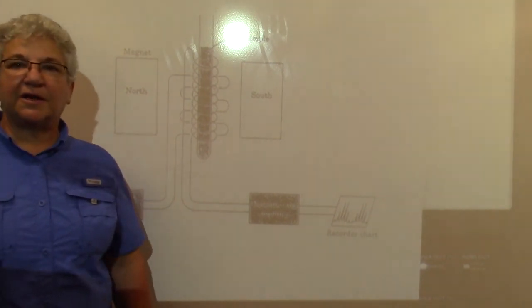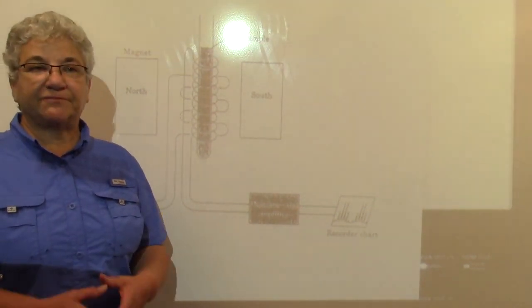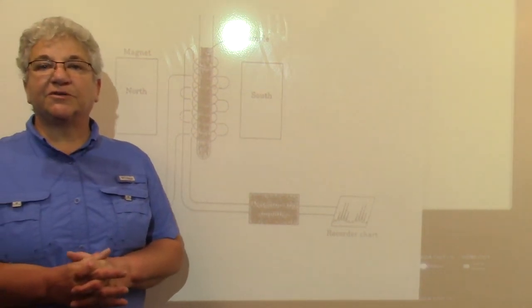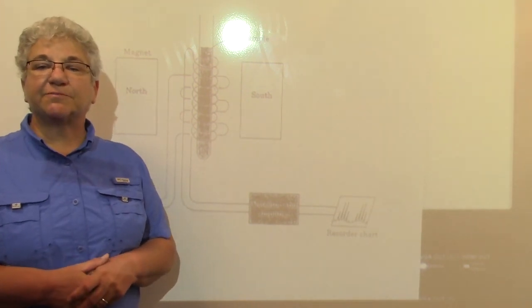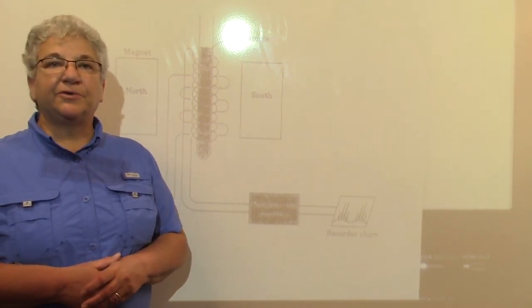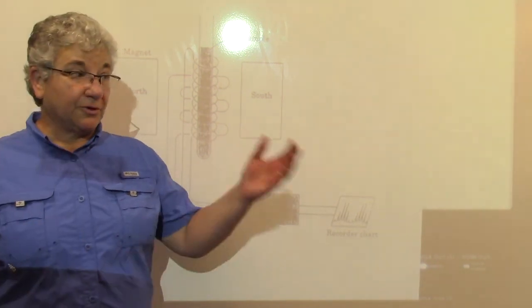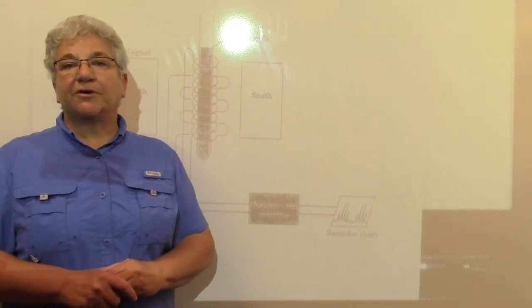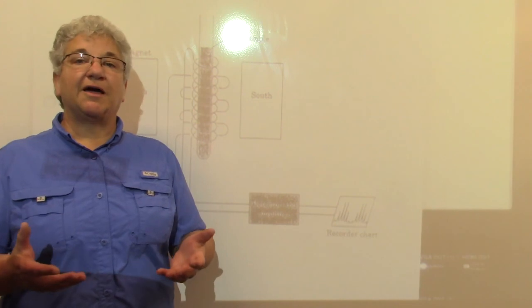Hi everyone, welcome to the C13 lecture. So this is going to cover material that is carbon-13 nuclear magnetic resonance spectroscopy. You will need to understand this, first of all, to do the homework problem or the lab assignment, but also secondly, so that you can interpret the results of the lab that you're doing this week.